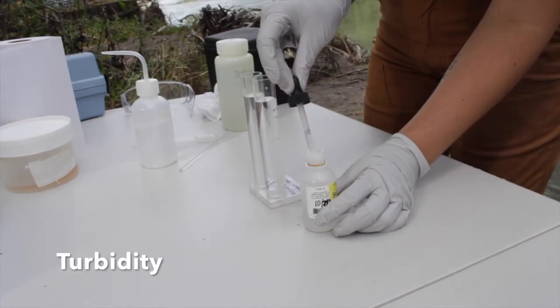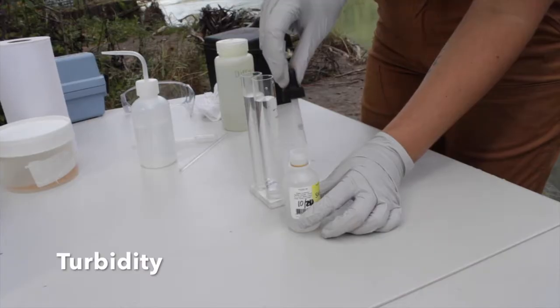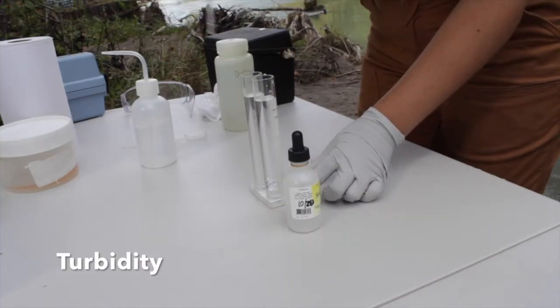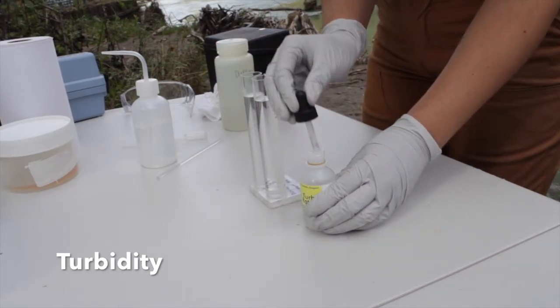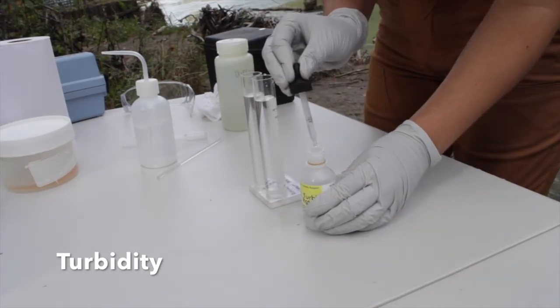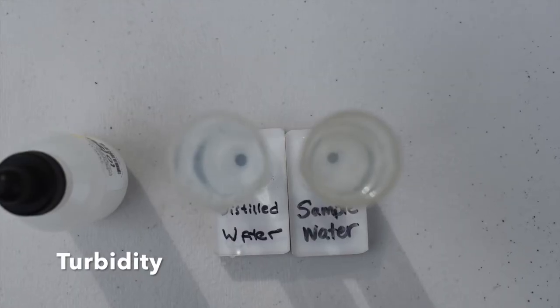Next, we will add a half milliliter dropper full of our standard turbidity reagent to the distilled water tube. We will continue doing this half a milliliter at a time until we see the dots in each of the tubes with equal clarity.